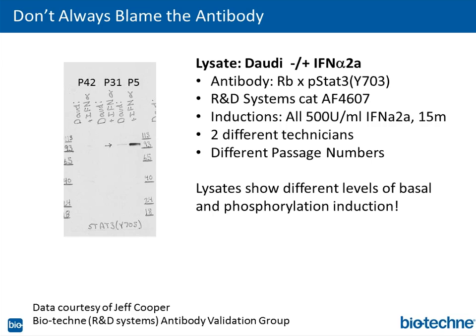Well, there's multiple variables, and we started to talk about this. I guess my overall message is you want to be consistent. You want to have a good positive control. You want to be consistent in your pipetting. You want to make sure your phosphatase inhibitors and your protease inhibitors are fresh and you're using the right ones. You want to minimize your freeze thaws. You want to make sure your cell density is not too high and you're collecting the cells at the right passage number, and your reagents are fresh. And even, if you think about it, the protein quantitation assay you're using.